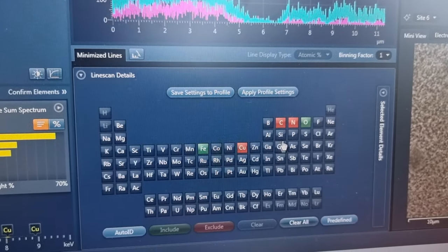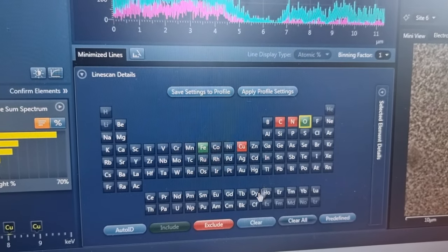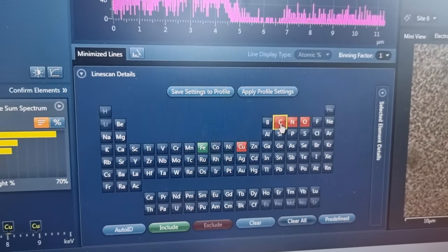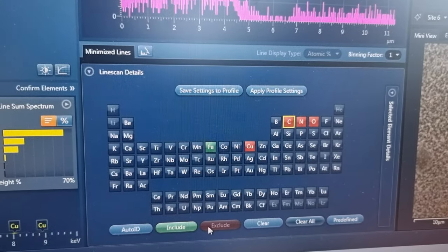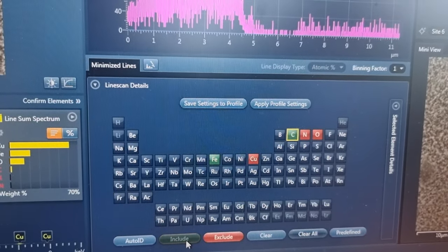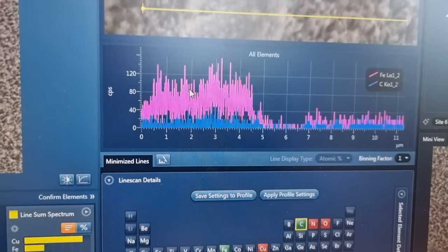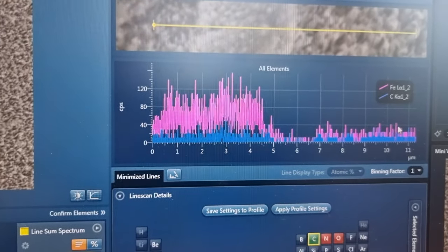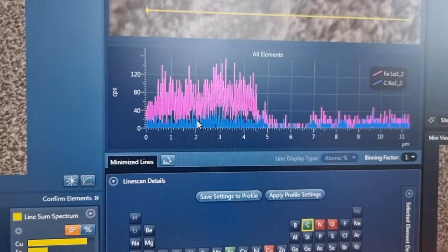We'll turn that off and try the carbon. See where the carbon goes. The carbon is pretty level across the whole lot.